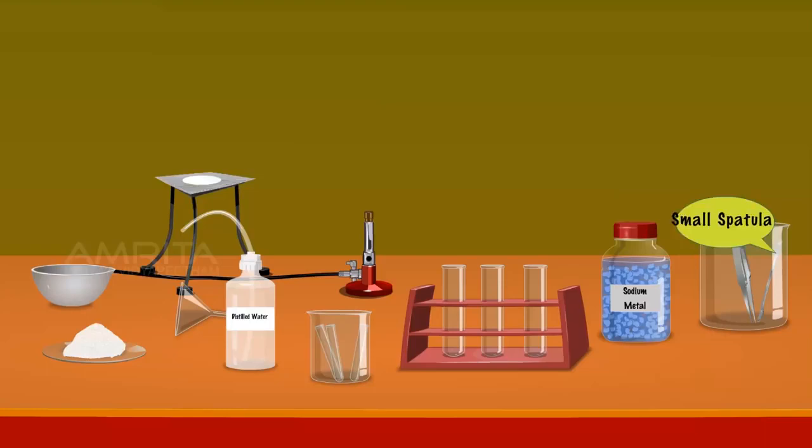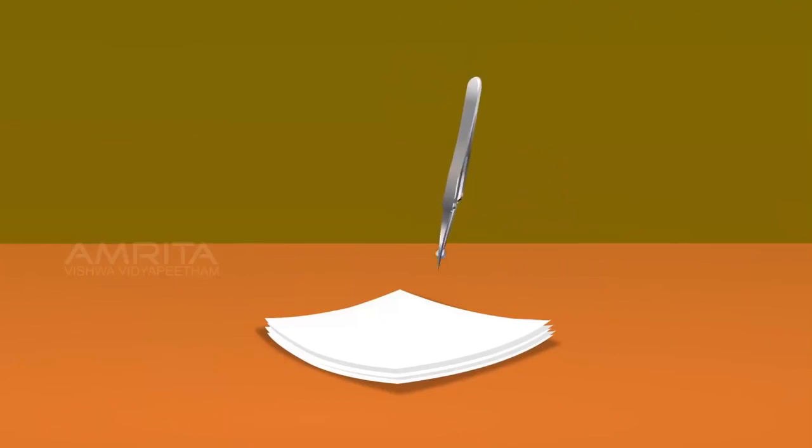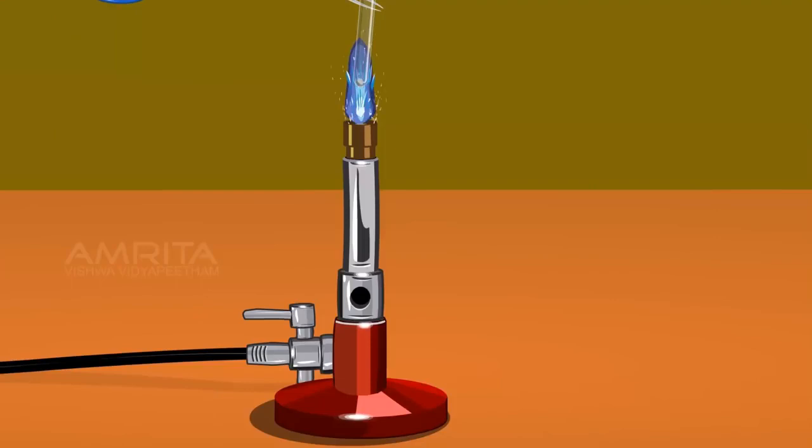Take a small piece of sodium metal using the forceps. Place the sodium metal piece on the filter paper and dry it by pressing it with another filter paper. Take dry sodium using the forceps. Hold a fusion tube using the tongs and put the dry sodium in it. Heat the fusion tube slightly over the Bunsen burner so that the sodium melts to a shining globule.